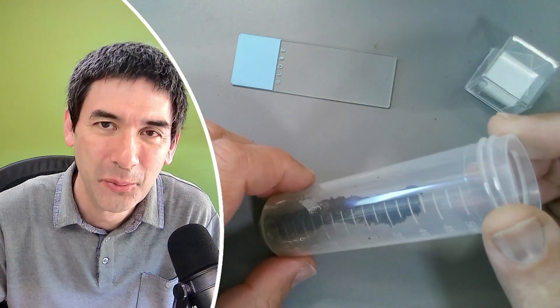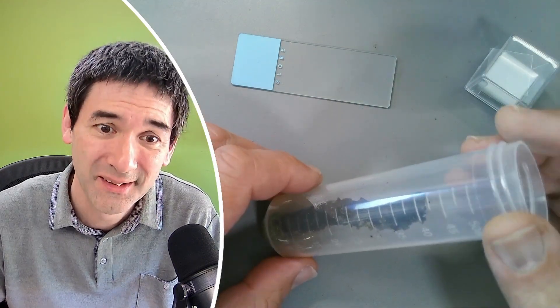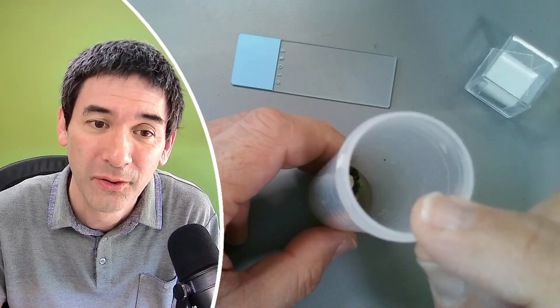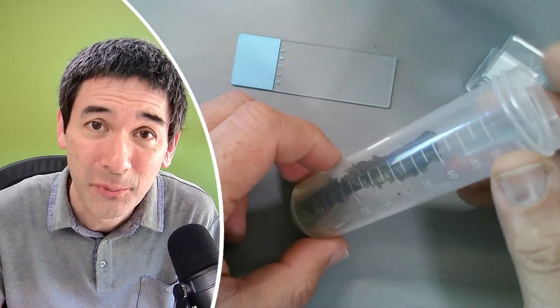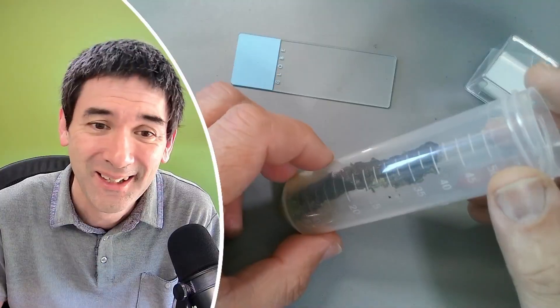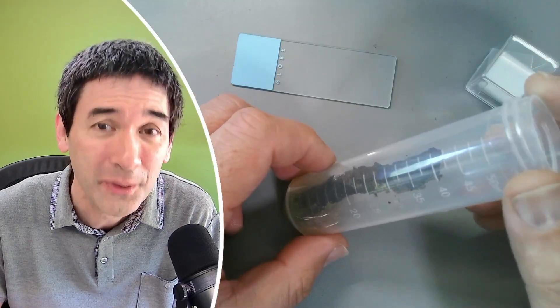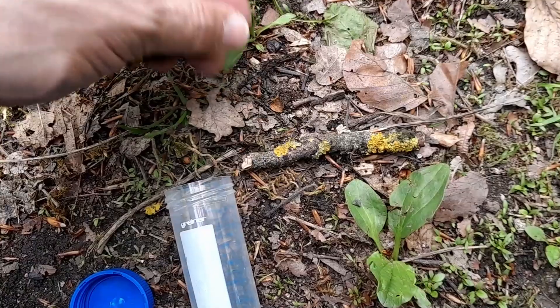Hello and welcome again. Microbe Hunter here, my name is Oliver, and today I'm going to show you how you can put this piece of old wood under the microscope. It's a simple preparation technique and I'm quite sure that we're able to find at least a few interesting microorganisms. A little bit of background information first.